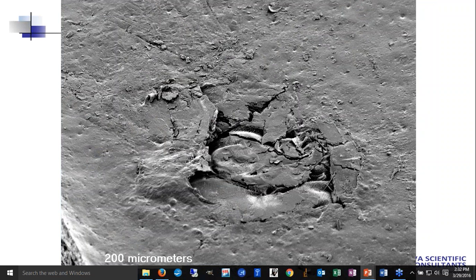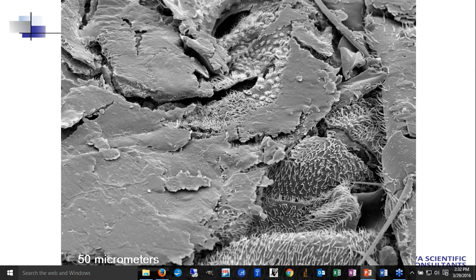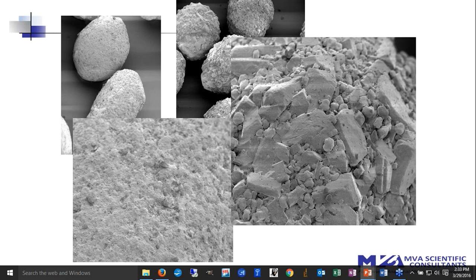Higher magnification with the SEM showed us that in these areas up here, you can actually still see some of the wing structure, and the fly body is embedded in the rubber, and this suggests that the flies were present during the compounding of the actual vial stoppers, suggesting that the flies were in the stoppers when they were purchased, and not during the bottling operation.